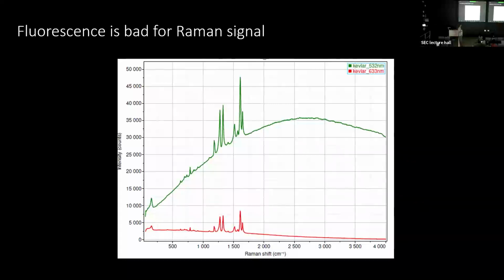And if we just switch to a longer wavelength light, we can get the Raman transitions without that fluorescence. So here we still have the Raman we can see. Often if you have fluorescence in your sample, it will overwhelm your Raman signal. So the way to get around it is often just to switch the excitation laser. So green laser to red laser reduces the fluorescence. So at CNS, between our 3 Raman microscopes, we have 5 different laser lines: 325, 405, 532, 633, and 785. And one of those 5 lines will probably get you either above or below the fluorescence.